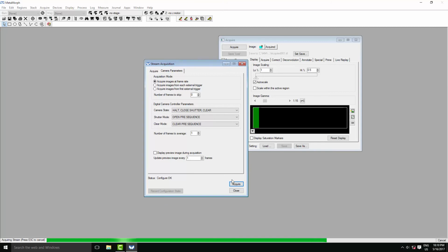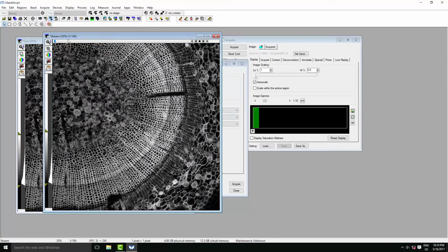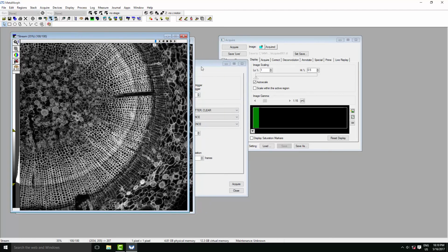So if we quickly take our 100 frame movie, at the top we can scroll to the end, and the timestamp will give us a rough idea of the number of frames per second that we've achieved. And as you can see, we're hitting our target of 31 frames per second using the USB mode of the camera.